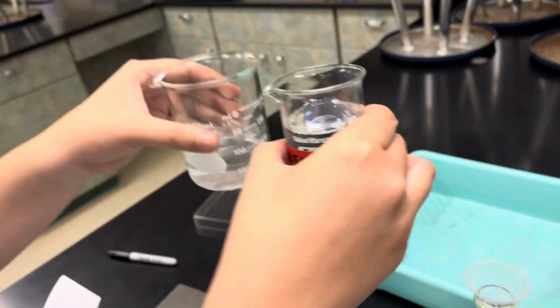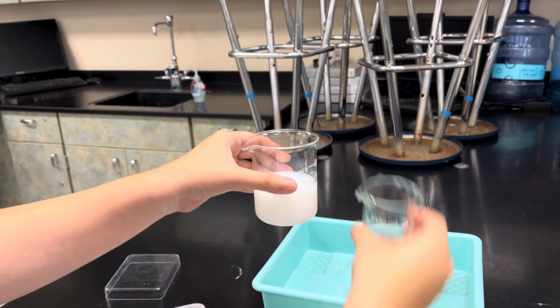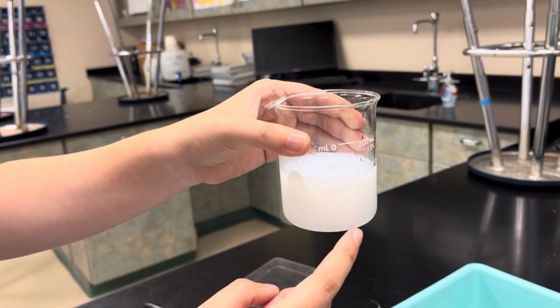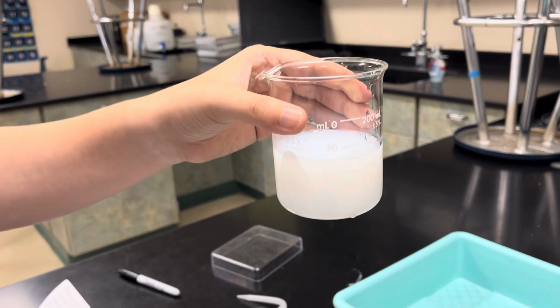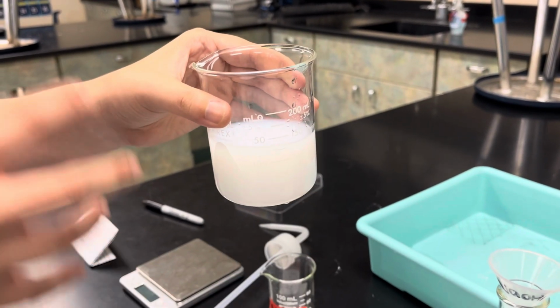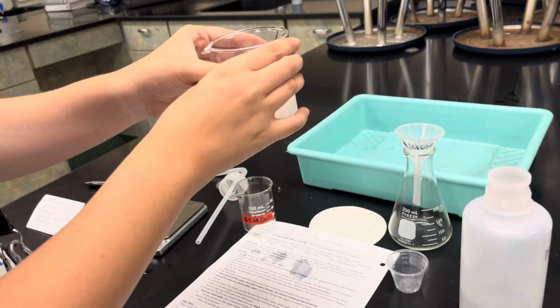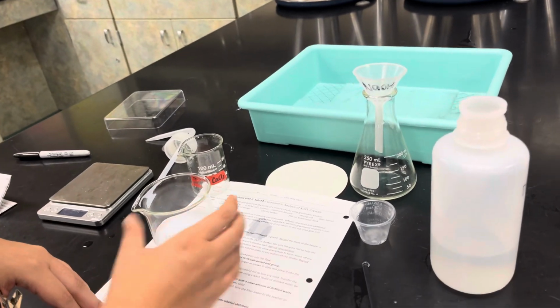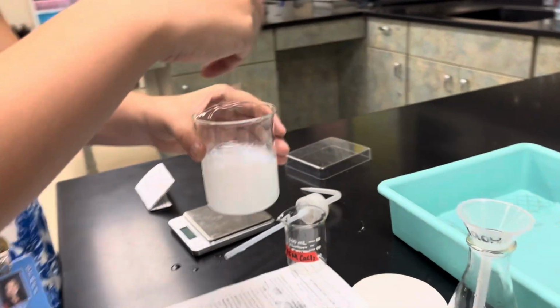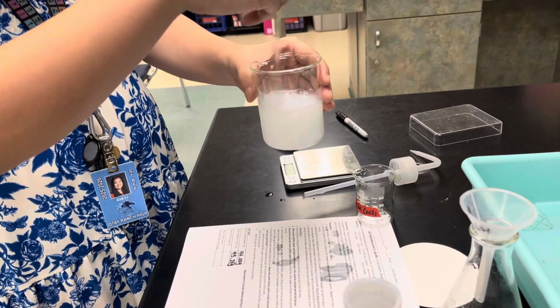So this is colorless, this is colorless. Let's mix them together. We spilled a little bit, but it's okay. So here is our precipitate. You can clearly see it is a milky color. Now you might be thinking, well, where's the solid? There's no rock in here, but it is really just little solid particles within the water. So they're just floating in there. So we should be mixing it just to make sure that it is fully combined. We want all of the precipitate to come out, all right?